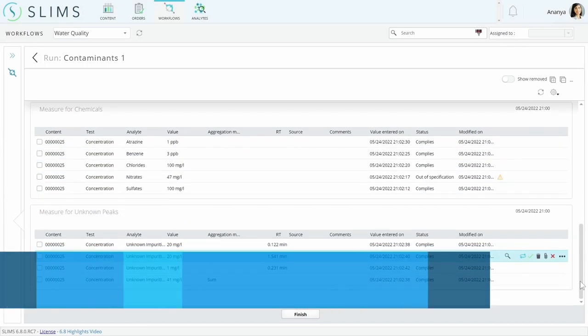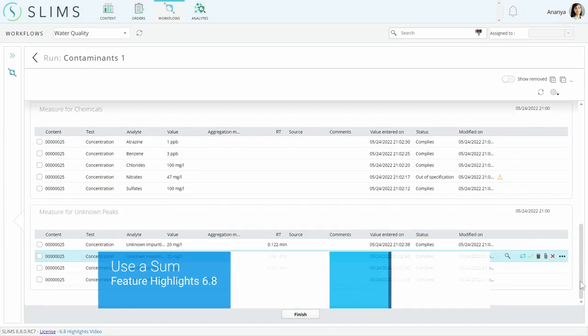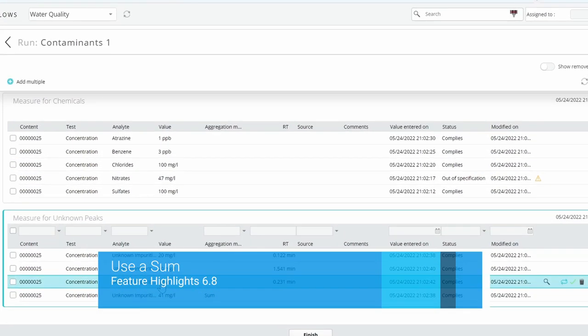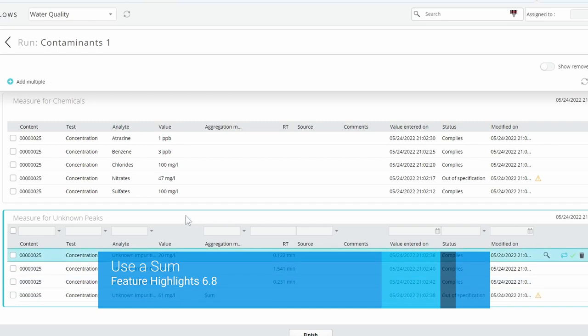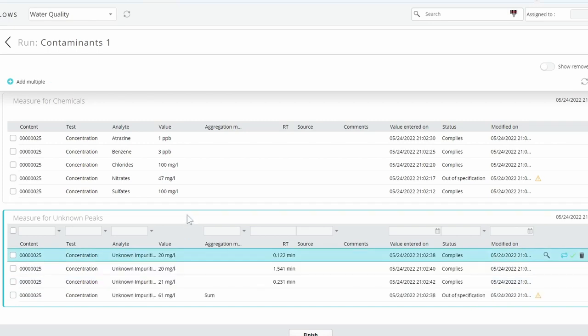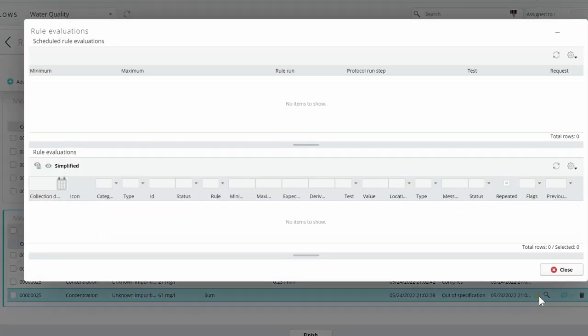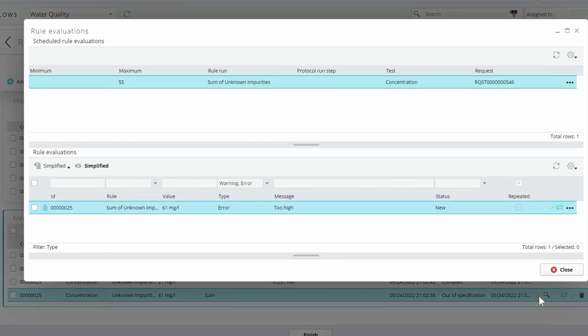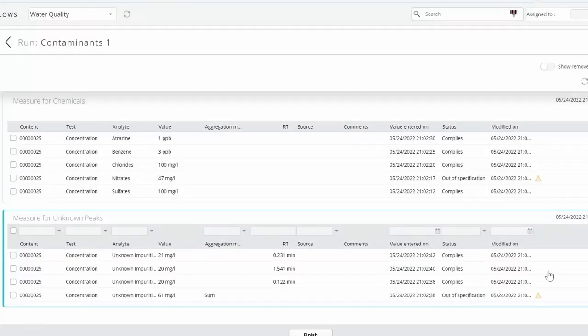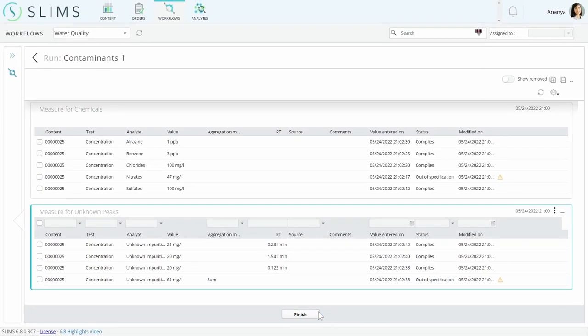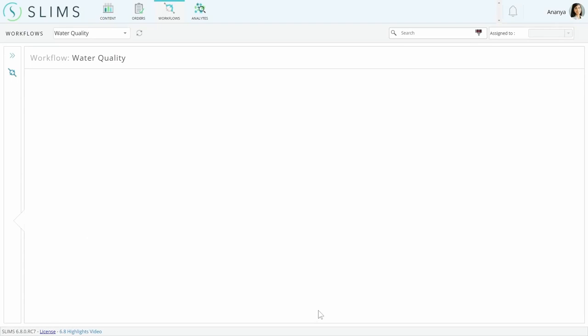There is another aggregation method added to this release called sum. It adds the other results for the selected test and provides the defined feedback based on the specification. We've used it to add the unknown impurities and provide an error if there are too many of them.